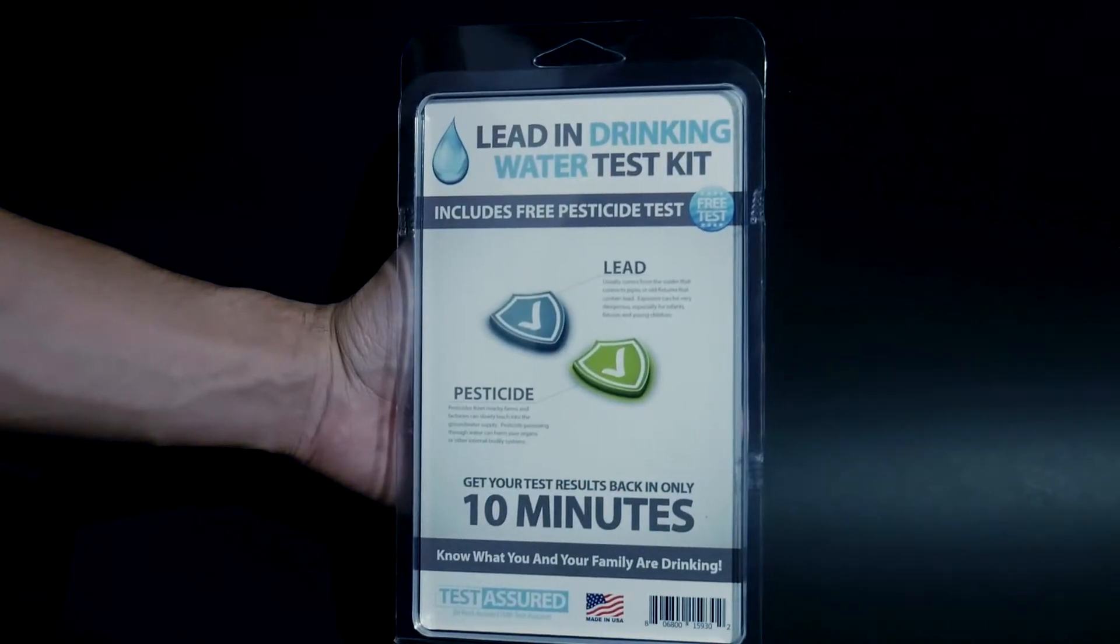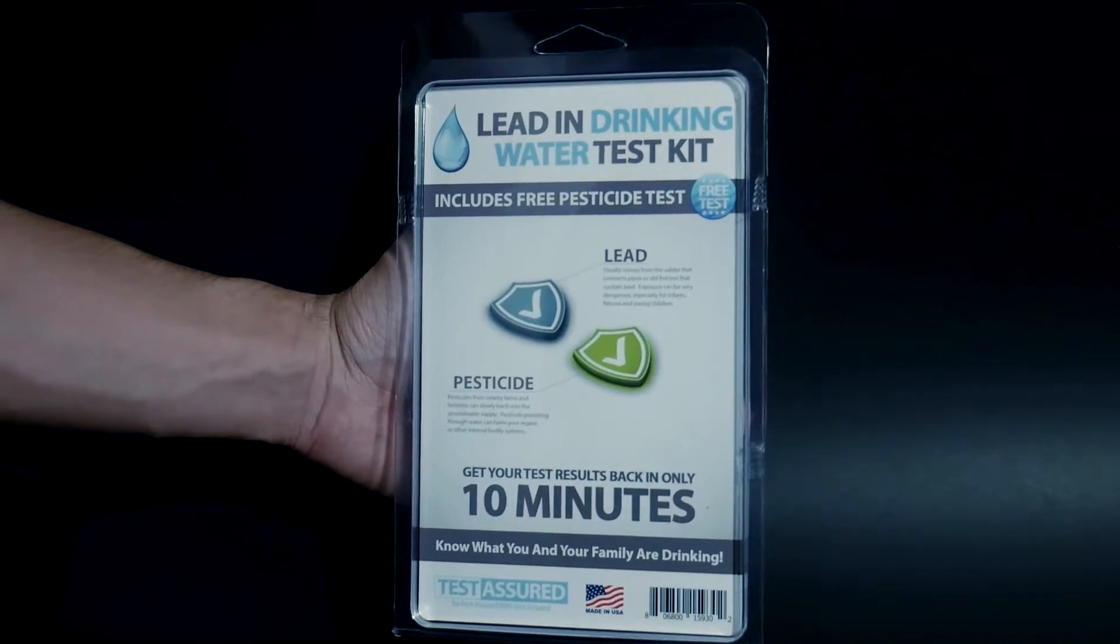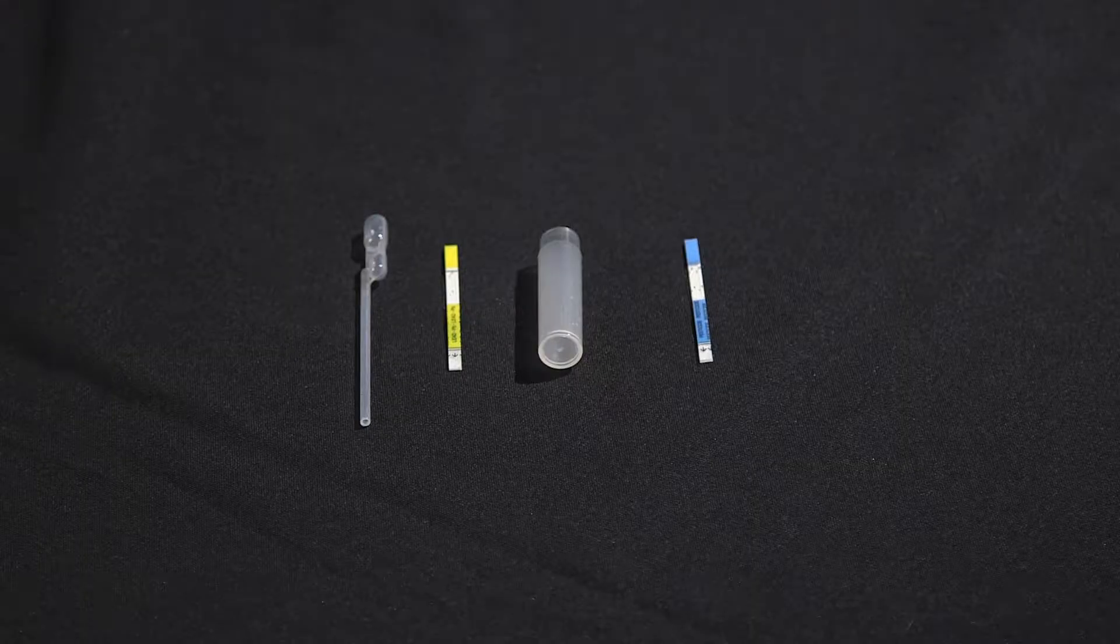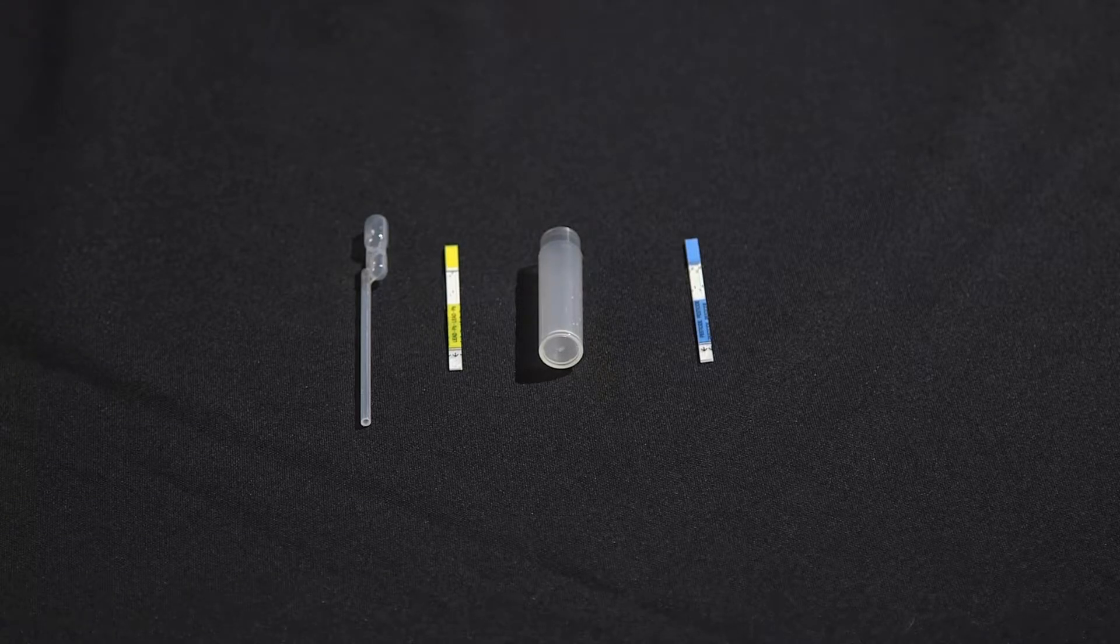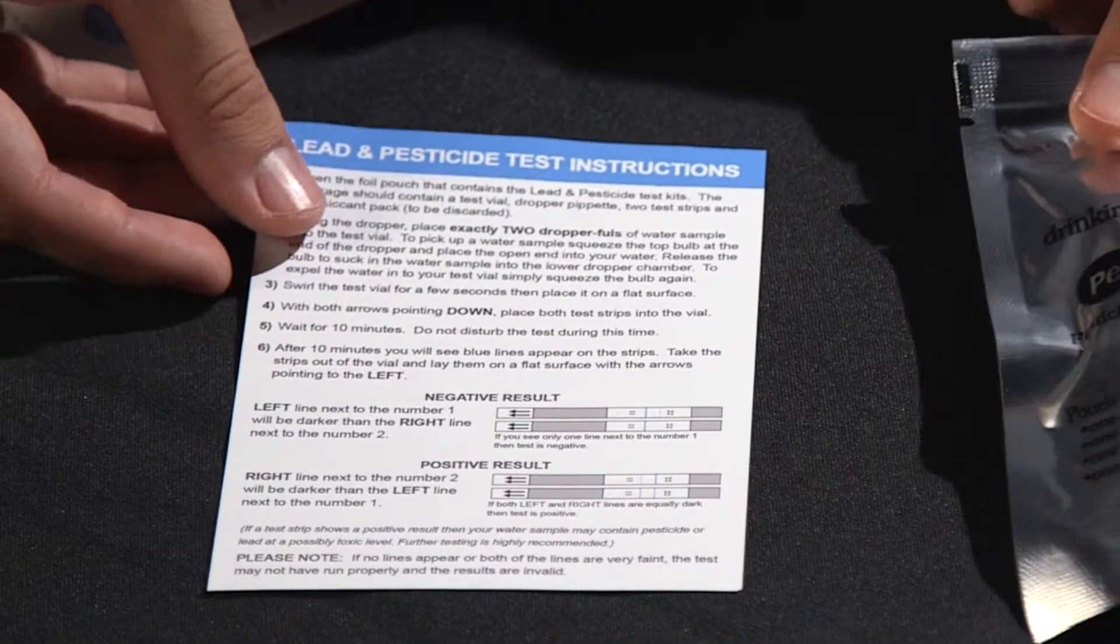For this test, we'll only need six items from your water test analysis kit: a water container, one pesticide test strip, one lead test strip, a test vial, a dropper pipe, and the sheet of paper containing the test result charts.